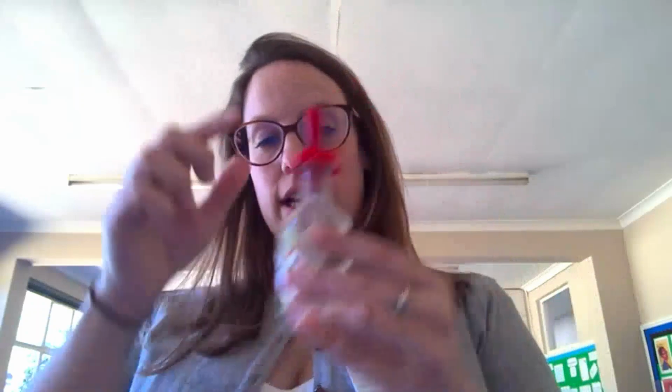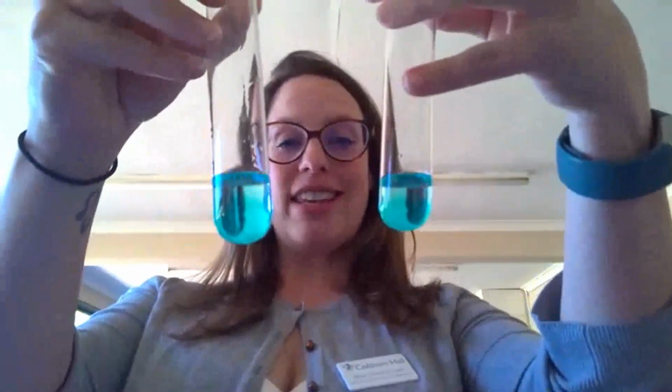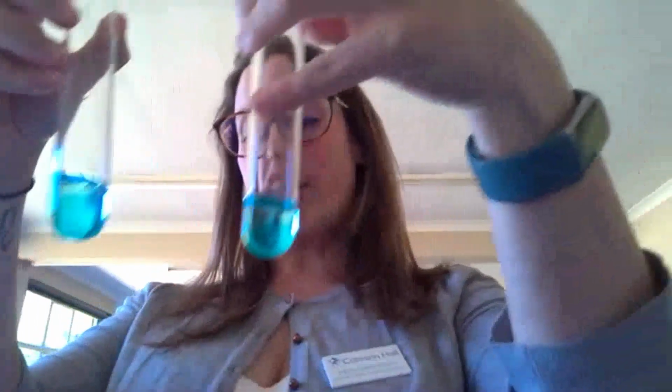I'm then going to add my Benedict's. Now Benedict's is bright blue because it does contain some copper sulfate in it. So this is the colour that your solution is going to go as soon as you add it. You can see now that both of mine look exactly the same. They're the same colour, and if I just left it like this, nothing would happen. I can't just wait for a bit and expect it to change colour.